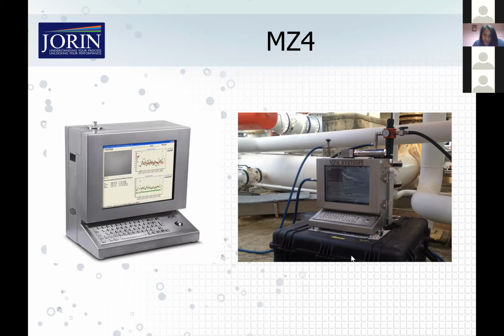Of course, we have software that's mated to our hardware. So the software does need validation. So we do have some validation steps you'd have to do for new sample points, but it's definitely not a calibration.